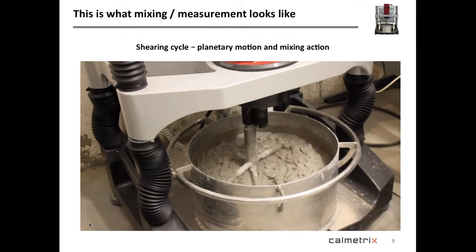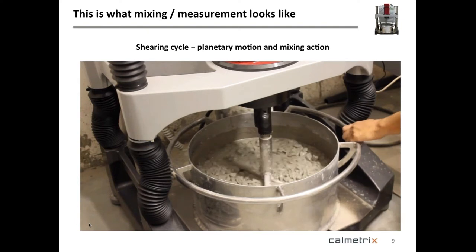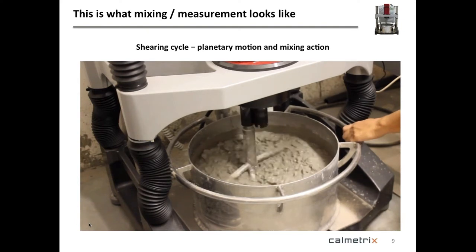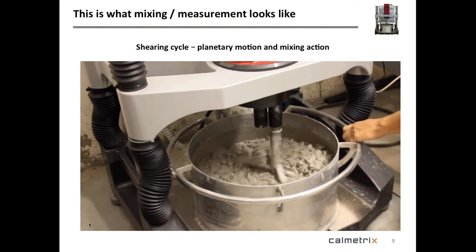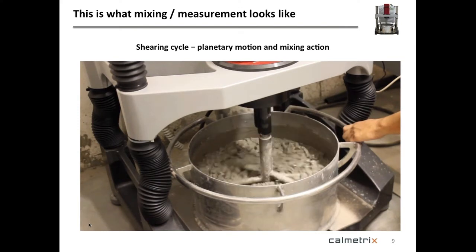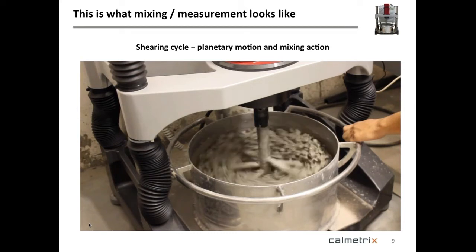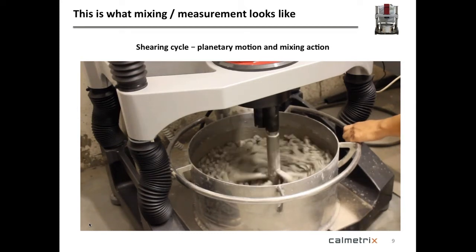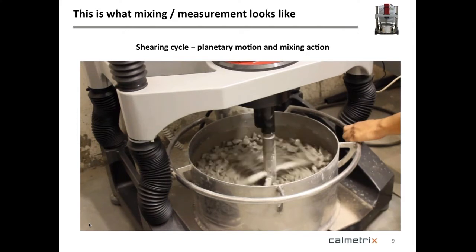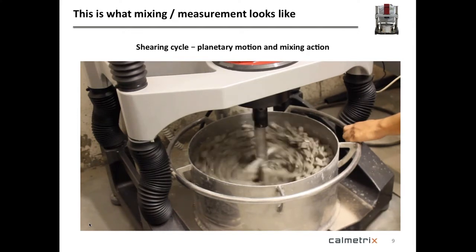And after it's settled, you start little by little getting bigger and bigger shear rates, so more rotation, and you look at the behavior, the response and torque measurement to those shear rates. You can also appreciate here the size of the vessel when you compare it to the hand of the person that's holding it. So you see that there's ample good size to have large particles in there.